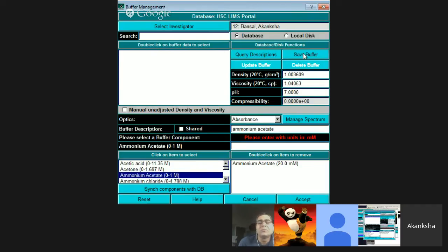Okay, well then it sounds like your database isn't correctly set up. What is your user name in the database? Akanksha. Let me just take a look here.